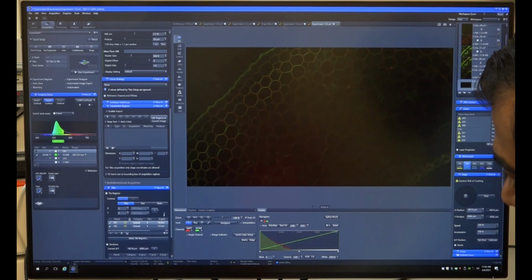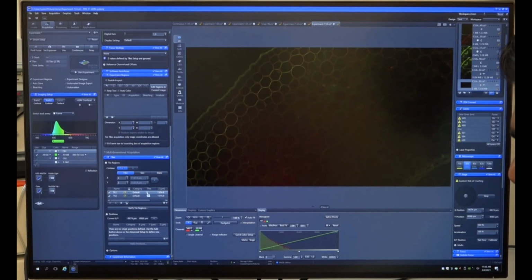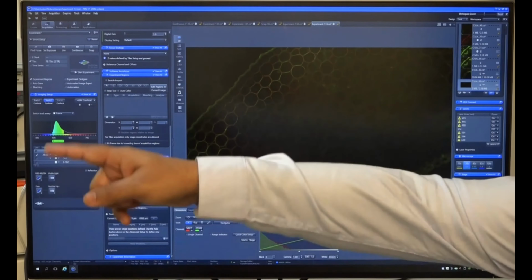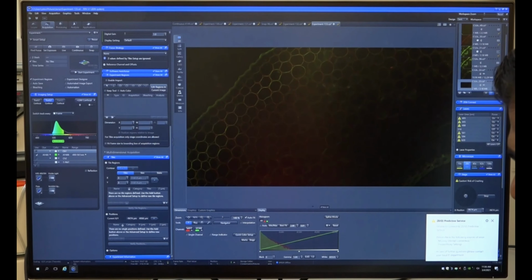Sorry, so this was 9 tiles. You see here, if I give region, so it was 9 tiles. So here in the first one, it was like 3 by 3, 4 by 4, whatever you want. But if you want to give more, you can also have options like this. Select one position, point A, select other position, it will stitch everything which comes in between, right? But there is another one, where I'll delete this, where you want to mark one position and go to altogether different position.